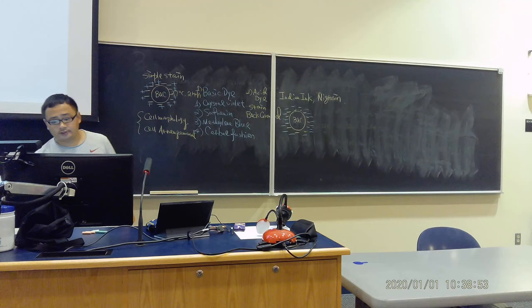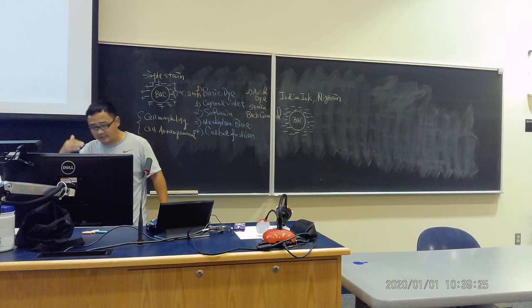So look at here, this is crystal violet stained E. coli. You will see it's a single rod. Corynebacterium diphtheriae causes diphtheria, with swollen lymph nodes and a soft pseudomembrane in the tonsil area. With methylene blue, you see it's a club shape. If you see this underneath the microscope from a patient sample, it gives you an initial idea of what the bacteria looks like.